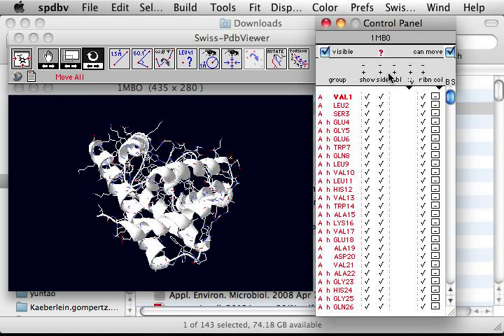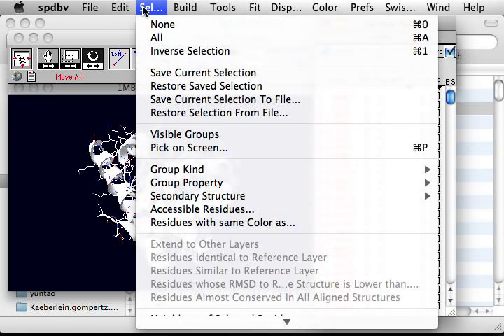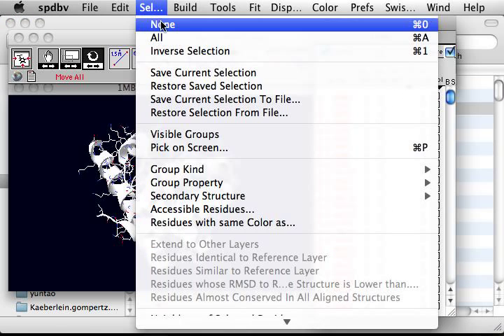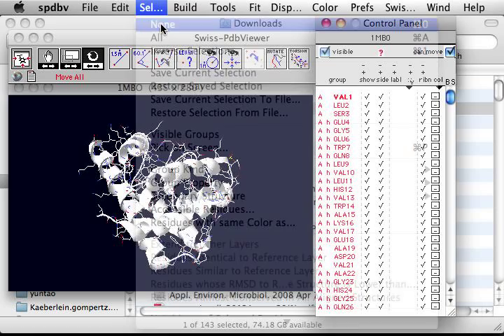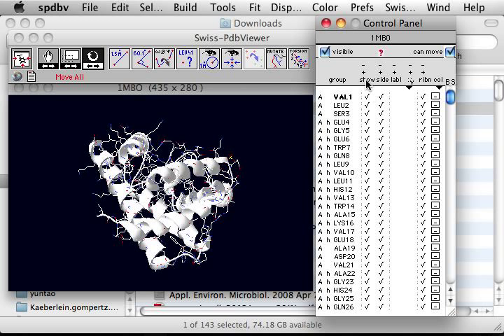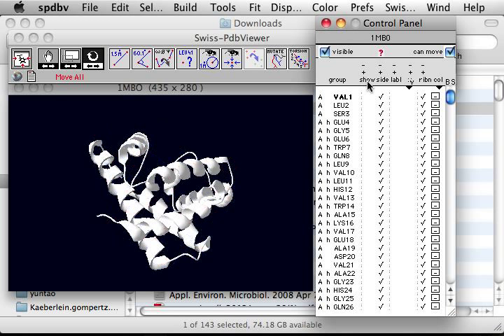I want to hide all the wild structure of the residues. Select none, then go to the control panel again and show nothing. Those are gone.